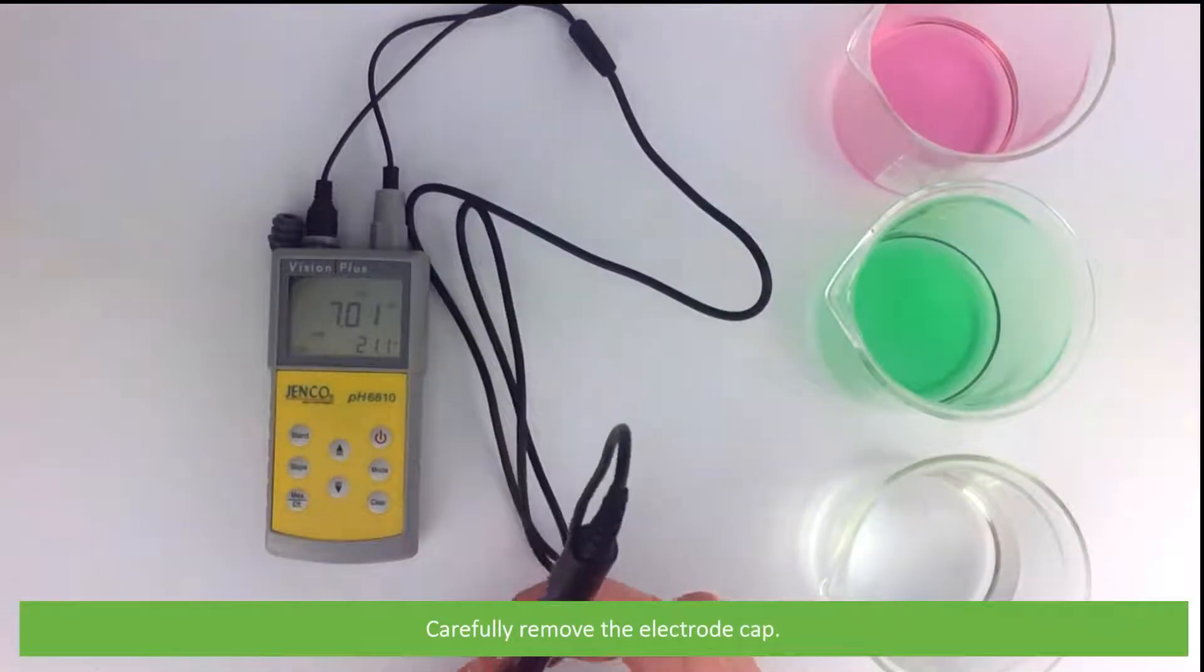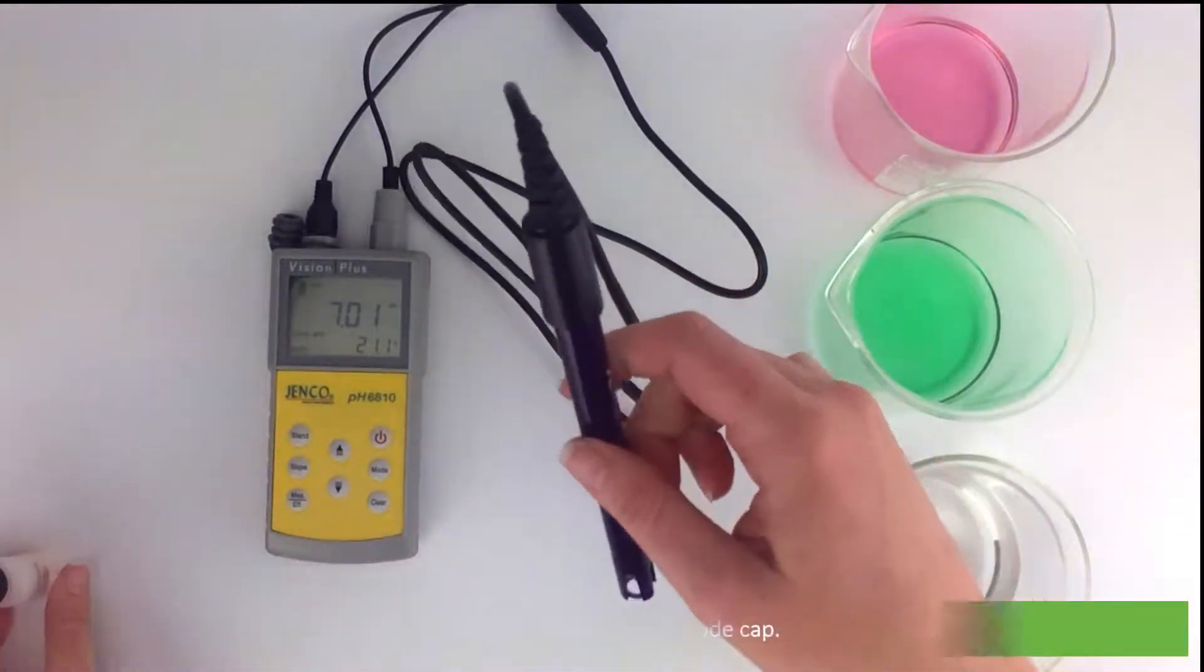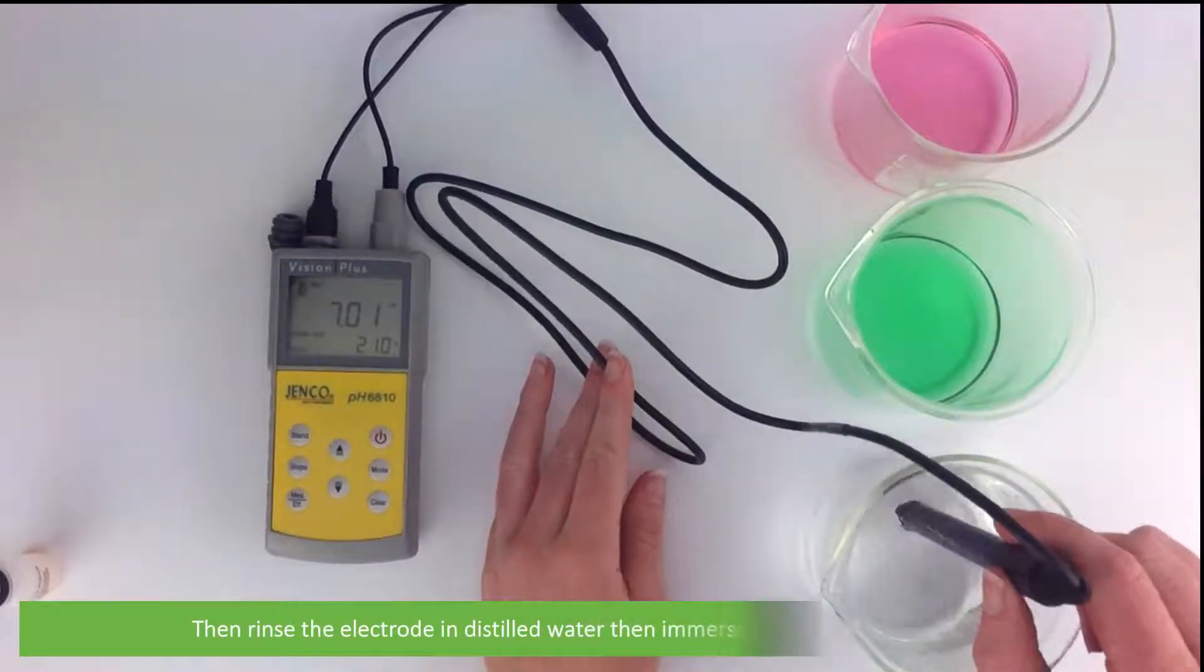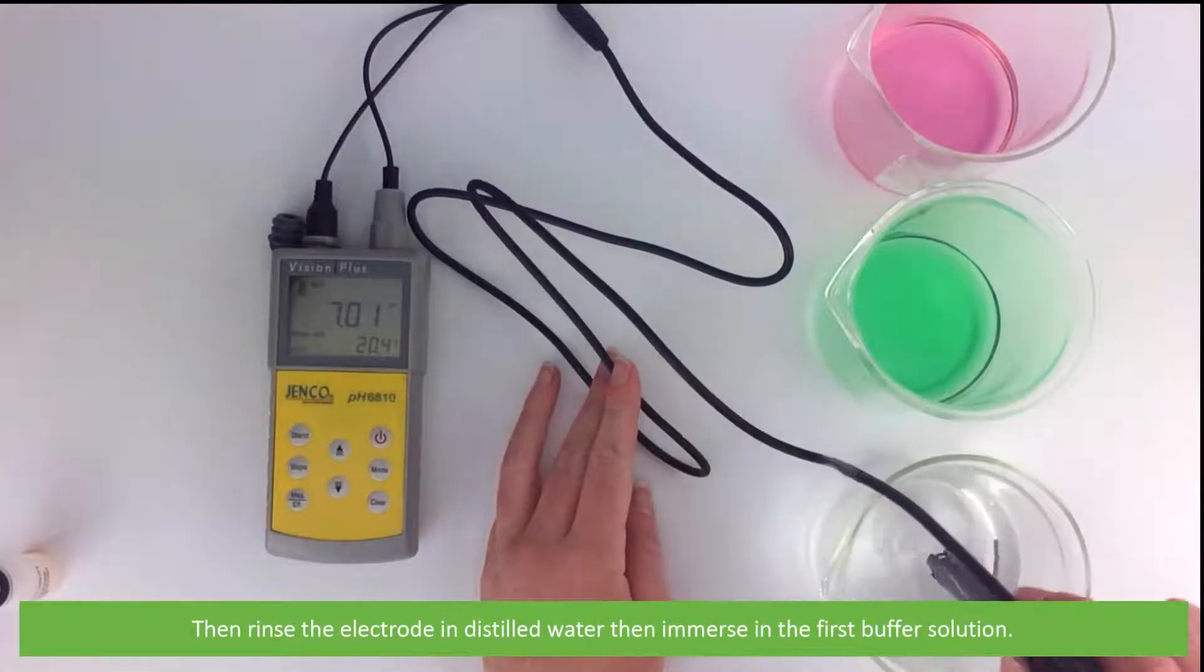You can now carefully remove the electrode cap. Rinse the electrode in distilled water and then immerse it in the first buffer solution.